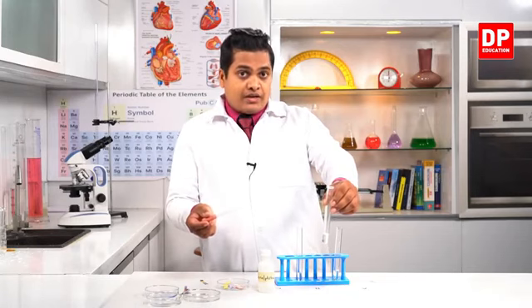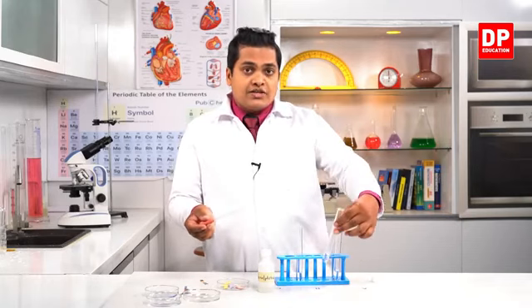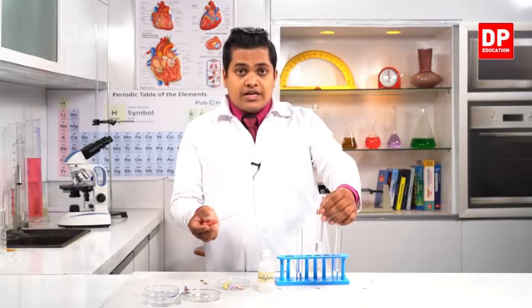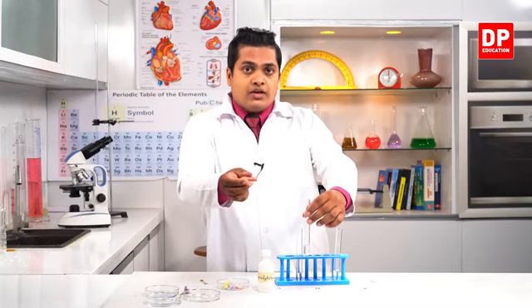Now let's try phenolphthalein with B. You know that phenolphthalein is giving out a pink color with bases. Now B solution is sodium hydroxide. Sodium hydroxide is a good base. So when I add phenolphthalein to this base, it should give out a pink color.